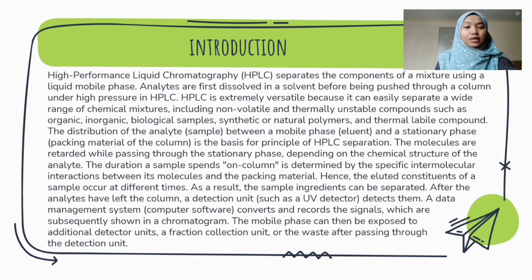Hi and Assalamualaikum. I'm Syahira binti Wan Muhammad Sabri. I'm going to explain about the introduction of the HPLC system. HPLC separates the components of a mixture using a liquid mobile phase. Analytes are first dissolved in a solvent before being pushed through a column under high pressure in HPLC.